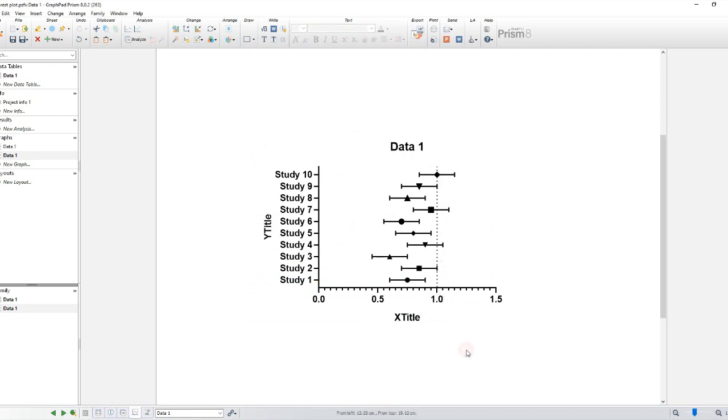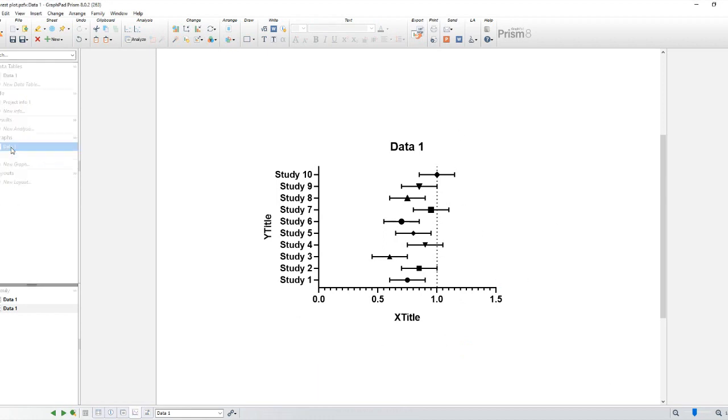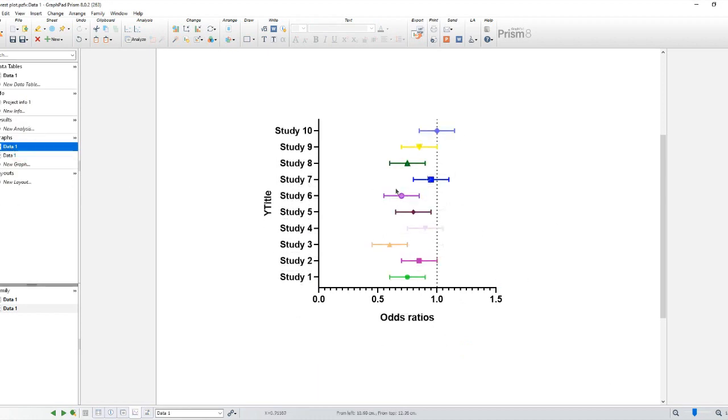Once the plot is created, you can further customize it by right-clicking on various elements, e.g., axis labels, data points, or legend, and selecting the desired formatting options.